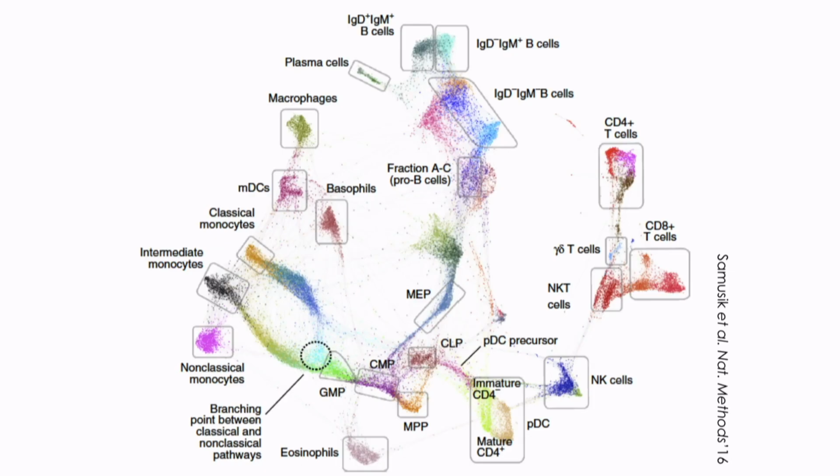looking at mouse hematopoiesis. And from my point of view, there are just two major things that single-cell analysis allows you to do compared to traditional methods. The first one is obviously to study extremely heterogeneous tissues, right? So here, this type of hierarchy, especially in the beginning of hematopoiesis, has been studied over decades, and this is a one-shot experiment that more or less illustrates it. Now, this is purely visual, of course, but you can dive in and actually statistically analyze the transcriptional profiles if you'd like. This is probably the main application of single-cell methods today.